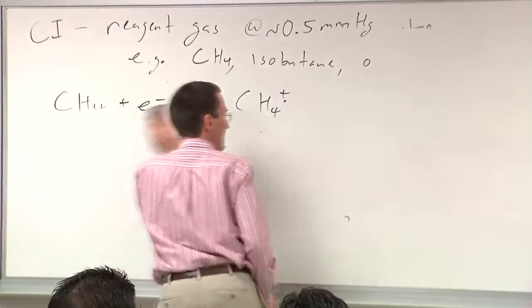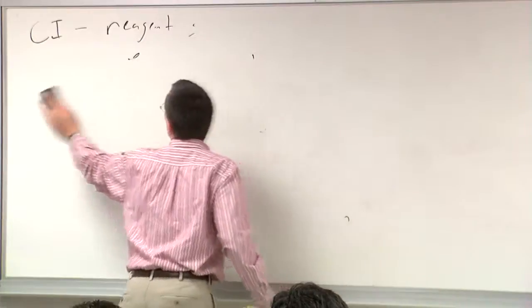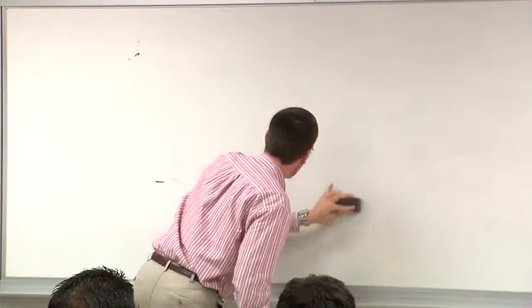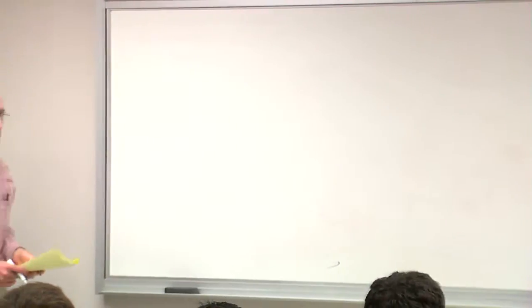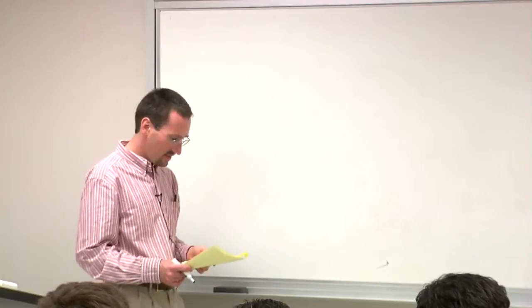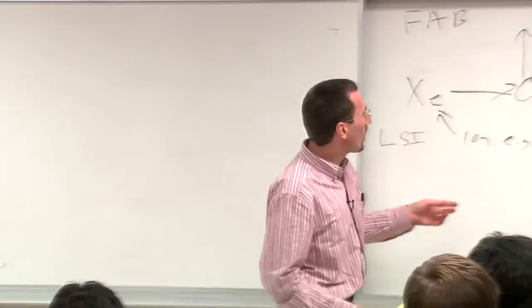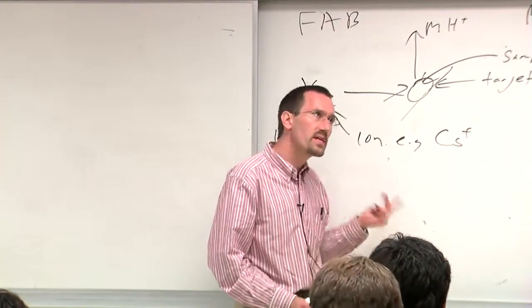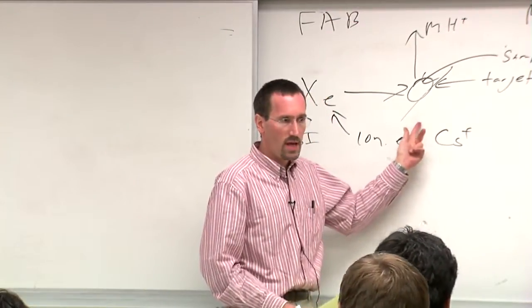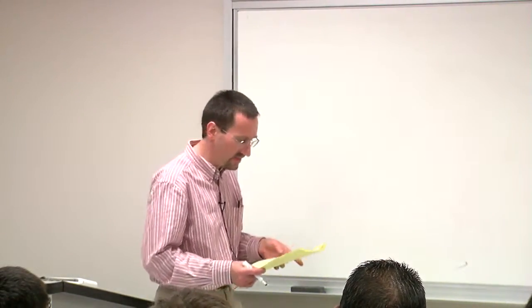John Greaves does the LSI technique. And again, I'm sure he will wax poetic on the differences between the two techniques, but for your purposes, they're pretty similar. All right, so does that change the type of detector you can use if the molecule's really big? It does. You can go with stronger magnetic fields, or I think typically this is done with a quadrupole. And then for MALDI, which I'll tell you about in a second, often people do time of flight because time of flight tolerates even bigger mass range.